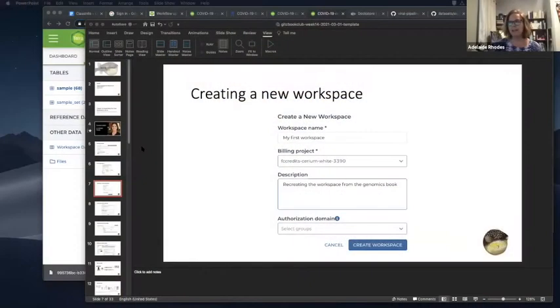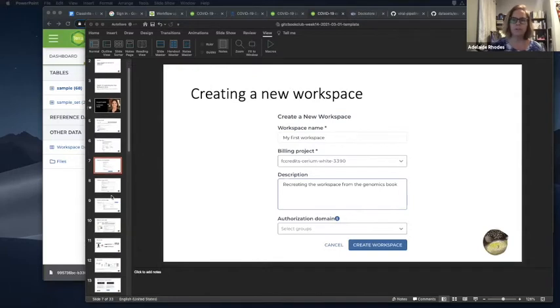Thank you. I am talking to you today about Chapter 13, but it's going to be a little bit of a different format because I want to actually use Terra for a project that involves the place I work currently, the NCBI. And I'm going to explain that at the end. But first, I thought I would just go through the slides, and this would be an opportunity for anyone to bring up issues they had with the chapter. But honestly, the chapter was so well written, I felt like the instructions would be very easy to follow. And we're very familiar with the GITC workspace, but there are so many other kinds of workspaces we can build out there. So I just wanted to go through a case study.